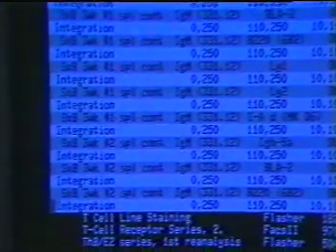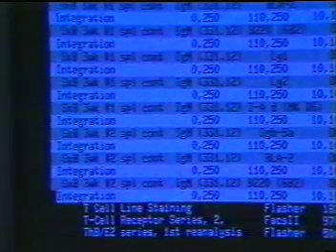When the secretary receives the Enter, Enter, Execute command, it places all jobs requested from that drawer onto the analysis queue. Analyses are normally processed on a round-robin basis in the order that they are received. Unless there is heavy traffic on the system, your results will be returned to your desk quite rapidly.